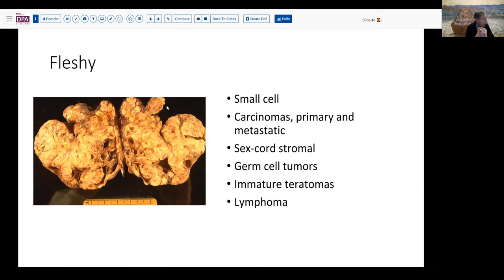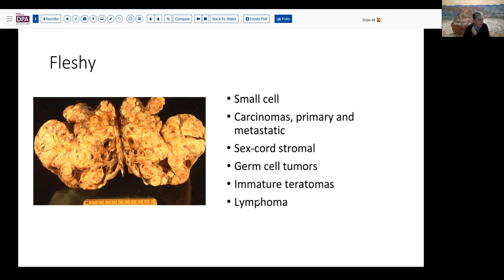The fleshy pattern is a very carcinomatous type of pattern very frequently associated with densely epithelial tumors. This can be seen with small cell tumors, carcinomas both primary and metastatic, colon cancers, some highly epithelioid sex cord stromal tumors, germ cell tumors, and immature teratomas. Occasionally lymphomas in the ovary will present with this sort of fish-flesh type of appearance — much more homogeneous — as opposed to the more multinodular mixed pattern with solid and focally cystic areas.